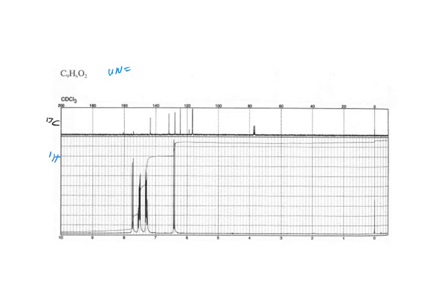C9H6O2. Oh. Nine minus six halves plus one. Six plus one equals seven. So we have a benzene ring plus some other things, and nothing is aliphatic. Correct.